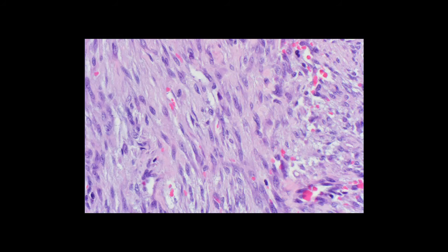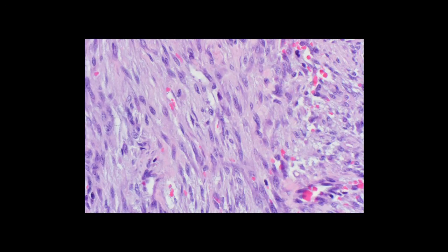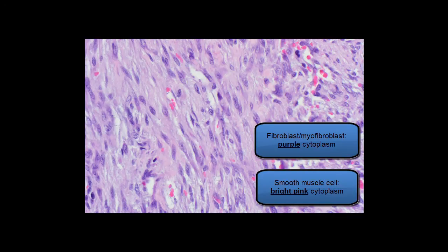Here's a high-power view of the cells. You can see that they have very bland nuclei with open chromatin and punctate nucleoli, and you do not appreciate very much nuclear atypia or hyperchromasia, as you would see in a sarcoma. The cells that comprise nodular fasciitis are actually plump myofibroblasts, and you can appreciate that each cell has a purple cytoplasm that extends from each end of the nucleus. The presence of a bluish or purplish cytoplasm in a spindle cell helps distinguish a fibroblast or myofibroblast from a smooth muscle cell, which has a bright pink cytoplasm.